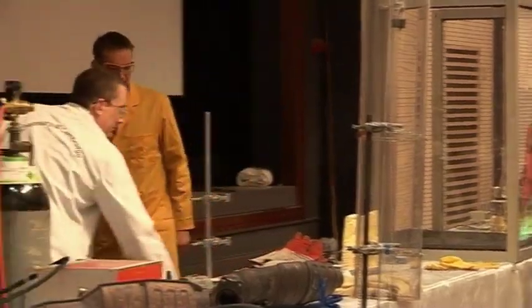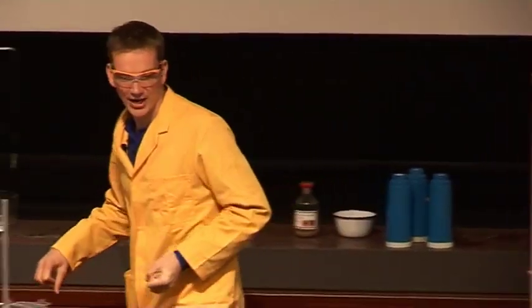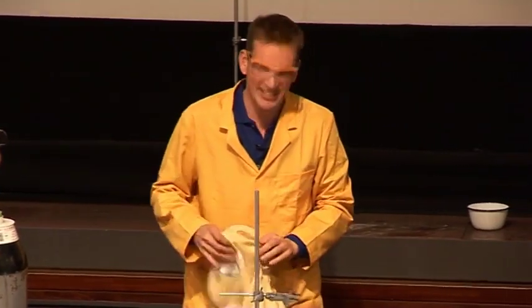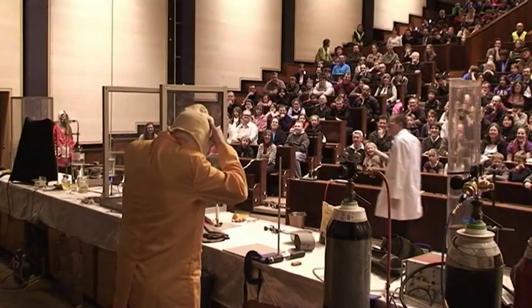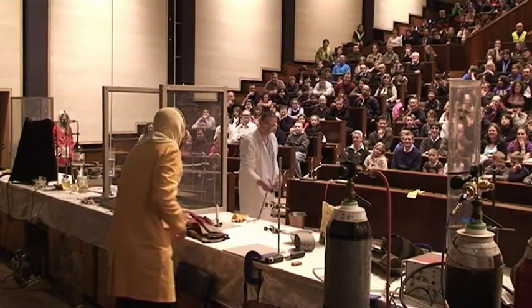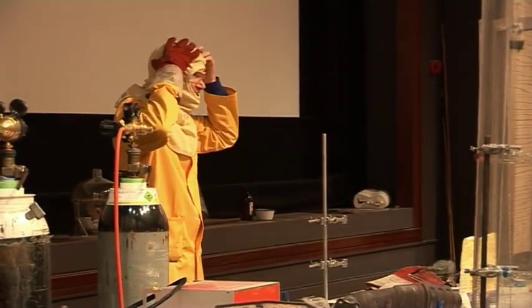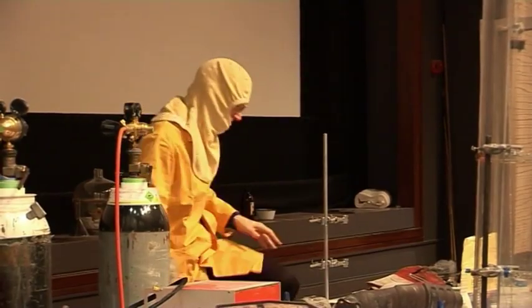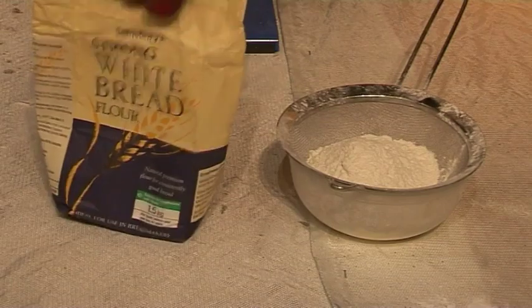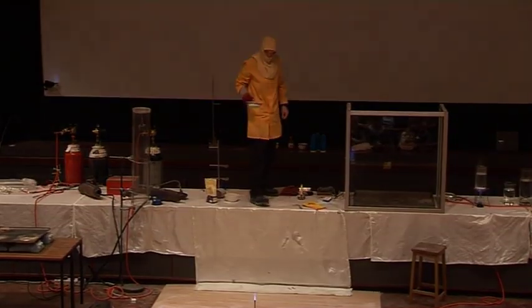Many things burn, and if we have them in a very finely divided state, you can get some very unexpected reactions with things burning. Now this one is just a tad frisky, so I need to be properly protected for this. I'm going to burn something particularly flammable now, and this is flour. If we have the lights down again, please. Thank you.